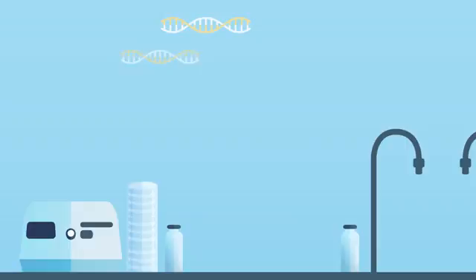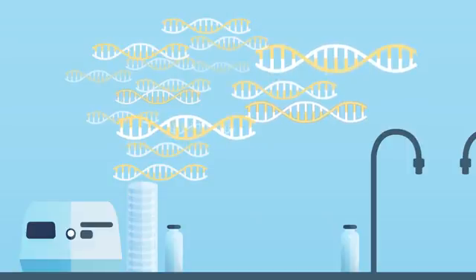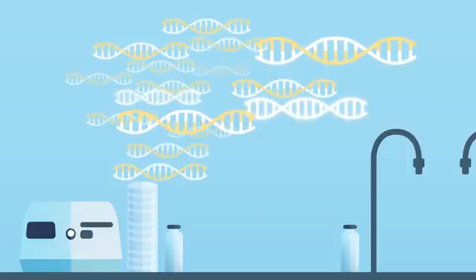PCR is an important tool in many molecular biology labs where it is used to amplify DNA or RNA fragments and detect nucleic acid sequences within a sample. In traditional or endpoint PCR, the amplification product is detected after the reaction is complete.